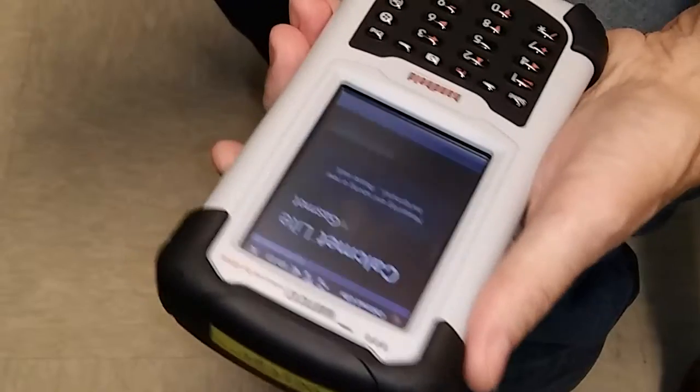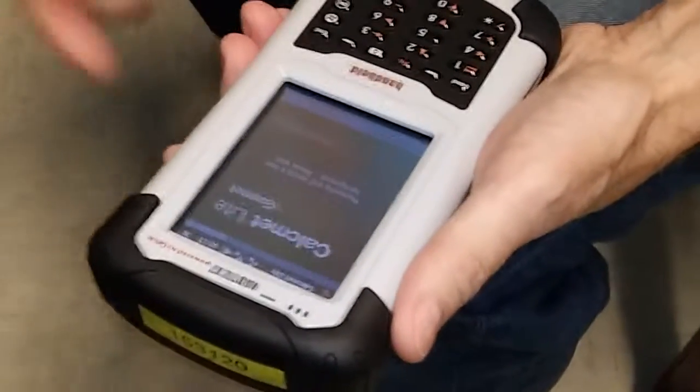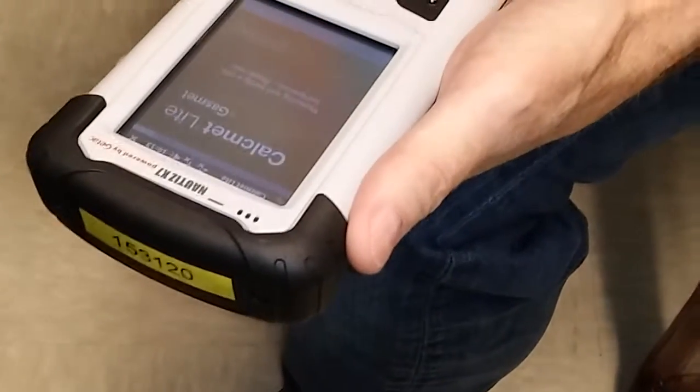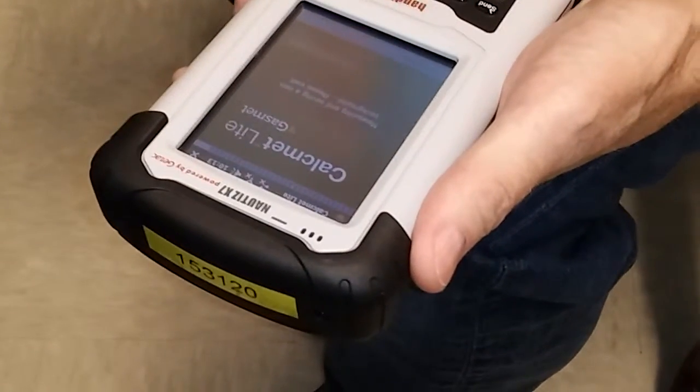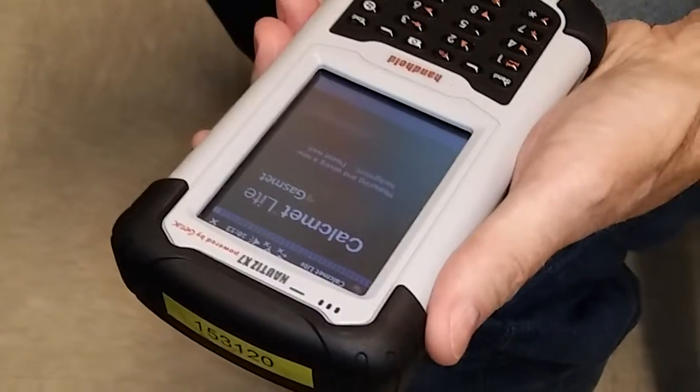Because if there's no carbon dioxide in there and I'm hitting minus 477 on here, then that means it's off by about 477. Well, it's just going to show me a spectrum probably.